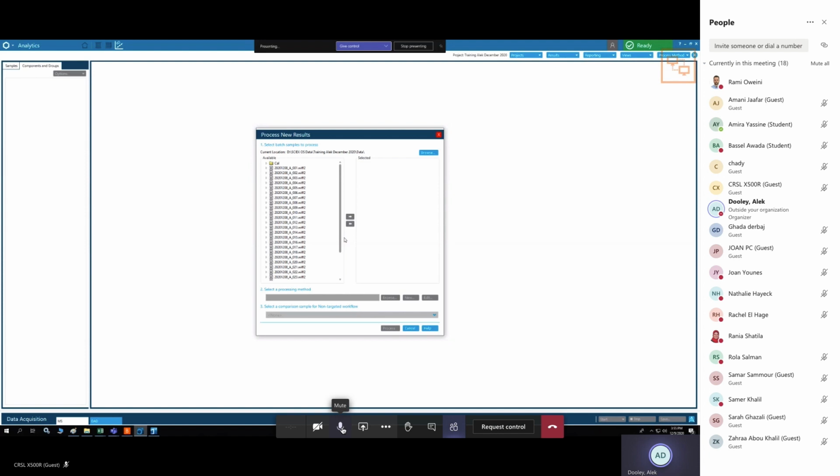Right, exactly correct. So the retention time will not be the same because the chromatography is perhaps very different. I don't know what column Mare used for that data, but I guess he used the little short column. Correct. Yes. So if retention time is different, then your peak will shift out of the search window. Don't forget, we set up that search window, right?